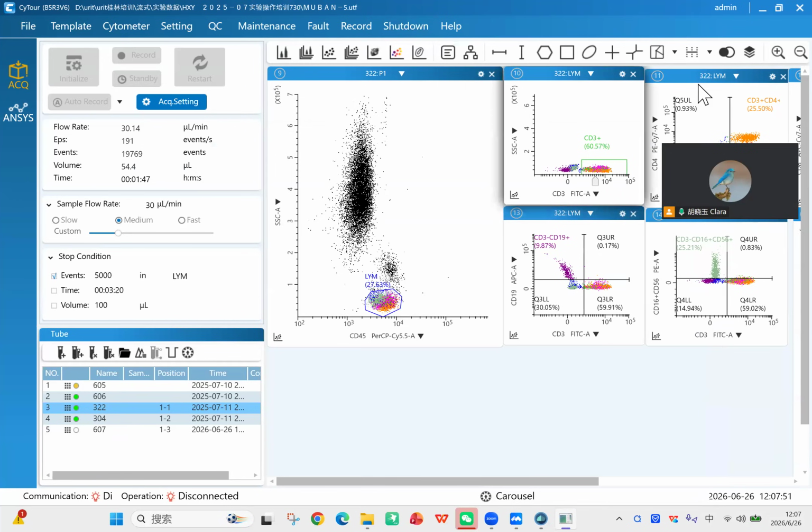And I think here's another thing I need to tell you: any machine will have some errors. For example, there is a prompt like error E01 or something else that tells which parts have which error and so on. Normally the prompts have the SWIP, I don't know how to say, sample here.